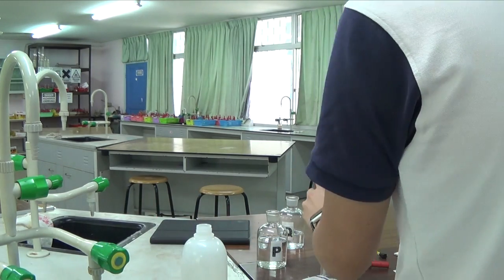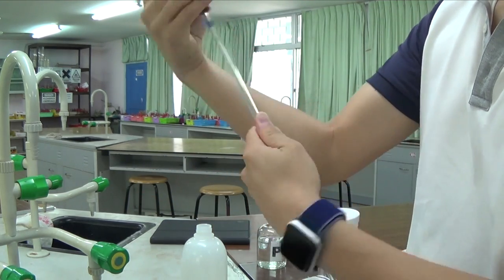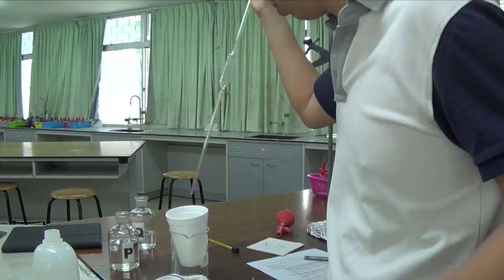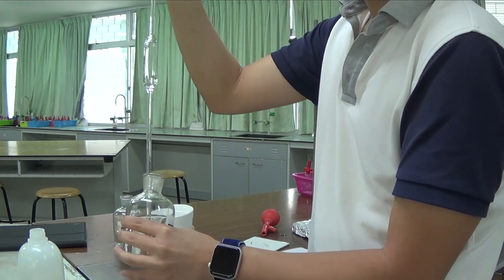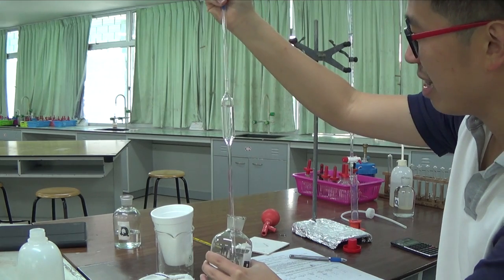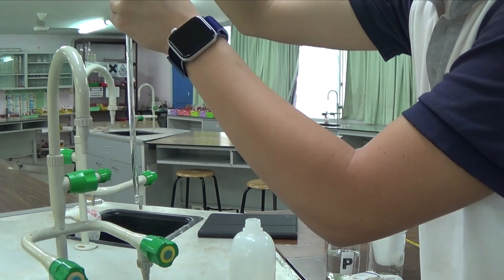Okay, so by the time you are familiar with instructions, they get really fast. So again, push it in, swirl it around. And then we're gonna suck in the solution from pipette P. So make sure that you do not get confused between the two solutions. So probably keep the burette solution on one side, close to the burette so that you never get confused. Alright. So I overshot it, so I need to eject this thing a little bit.